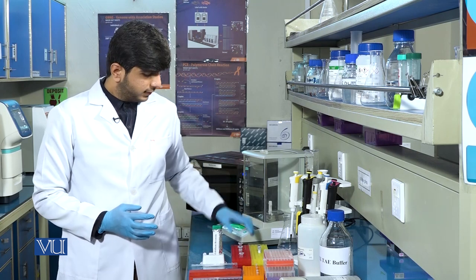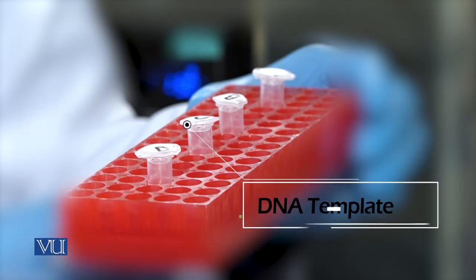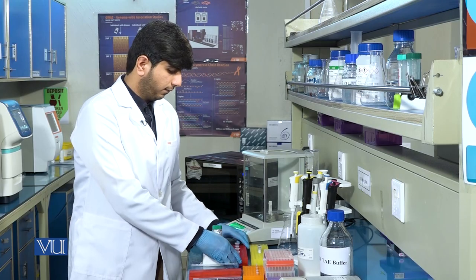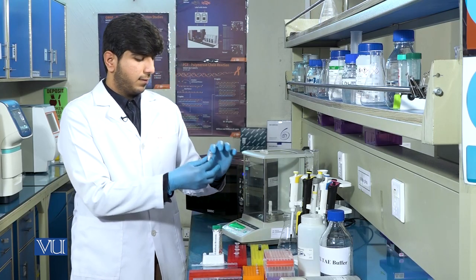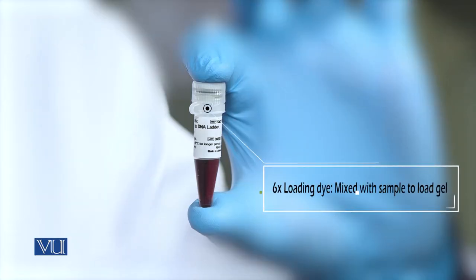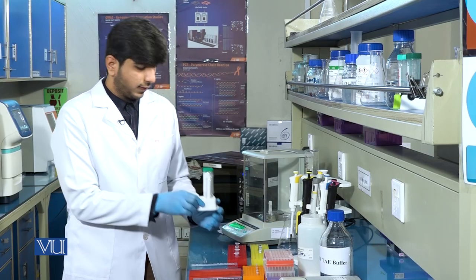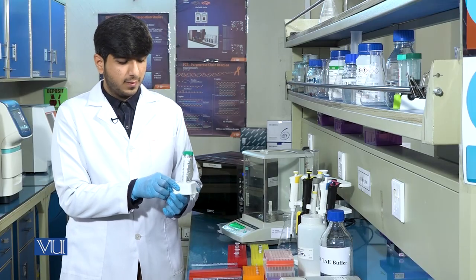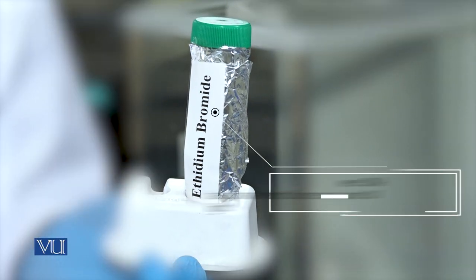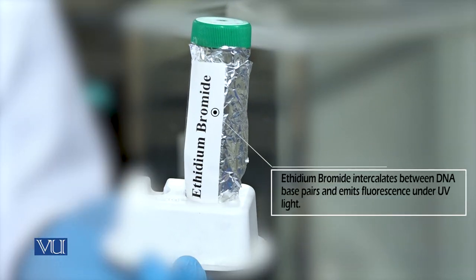For the agarose gel electrophoresis, we need DNA template, 6x loading dye which is Bromophenol blue, and ethidium bromide, which is a fluorescent dye used to visualize the DNA under UV light.